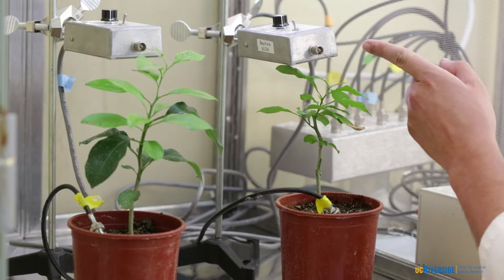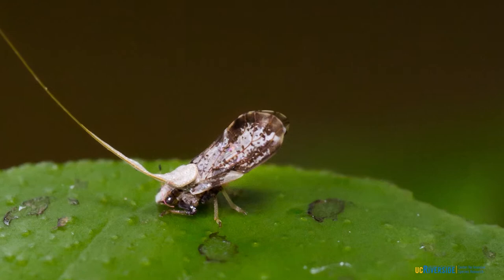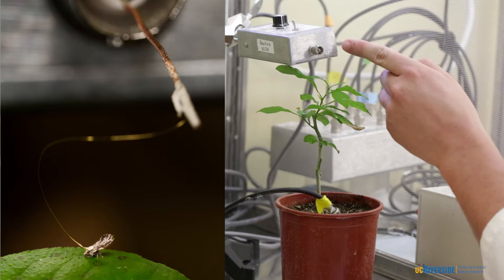and then we actually have our Asian citrus psyllid sitting on the leaf, and we've taken a very small gold wire and glued that to their back, and that's actually being inserted into an amplifier, which you see here.